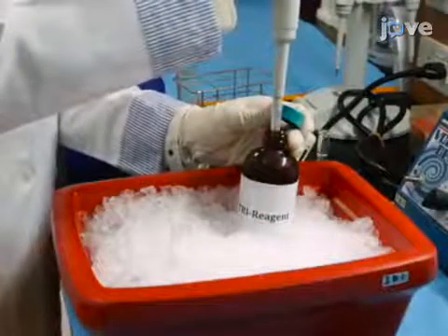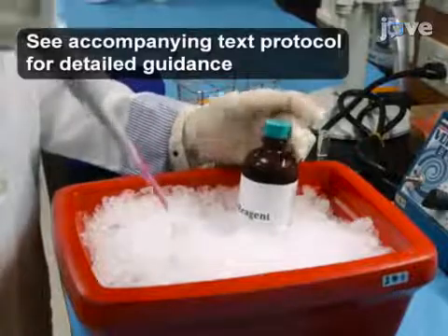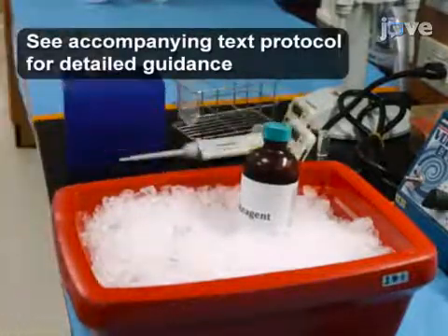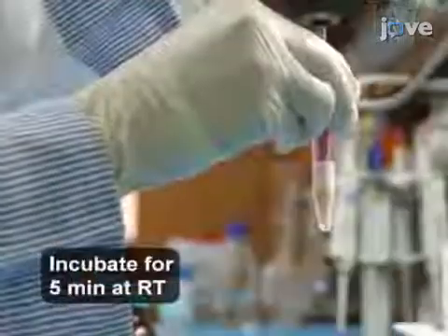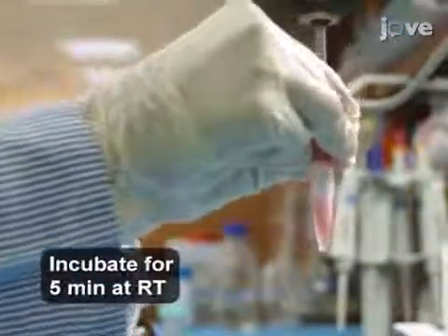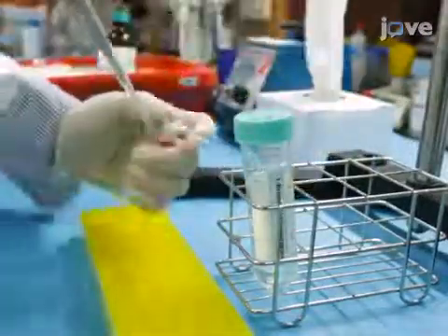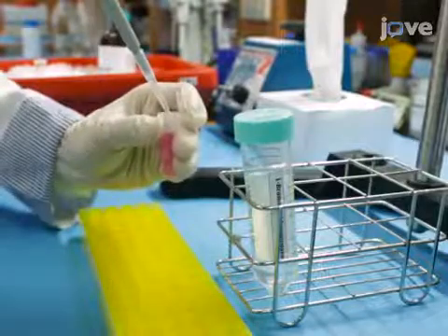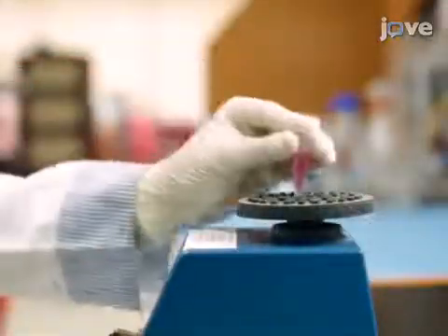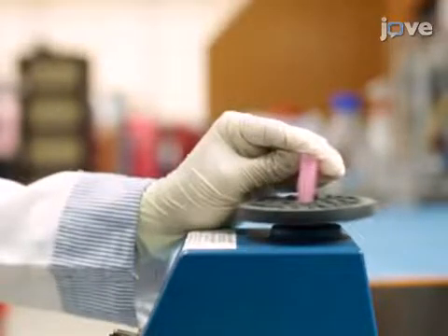Obtain RNA isolation solution maintained at 4 degrees Celsius and add 1 milliliter of the solution to about 75 milligrams of mouse tissue. Use an overhead stirrer to homogenize the tissue. Next, add 100 microliters of 1-bromo-3-chloropropane per 1 milliliter of sample homogenate. Shake the tubes vigorously for 15 seconds and proceed to total RNA isolation.